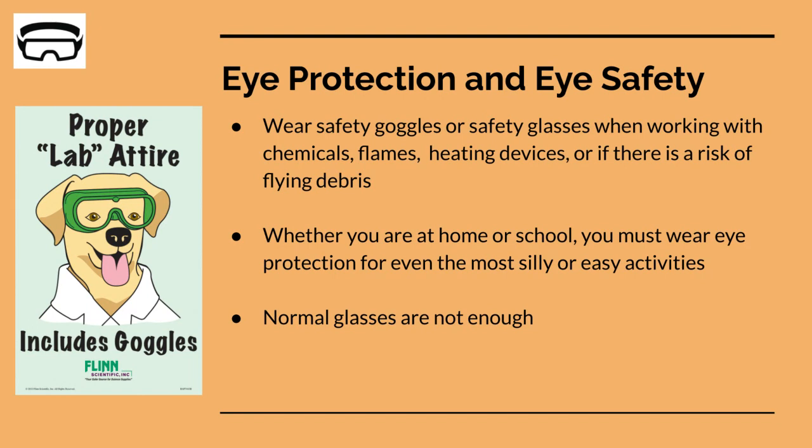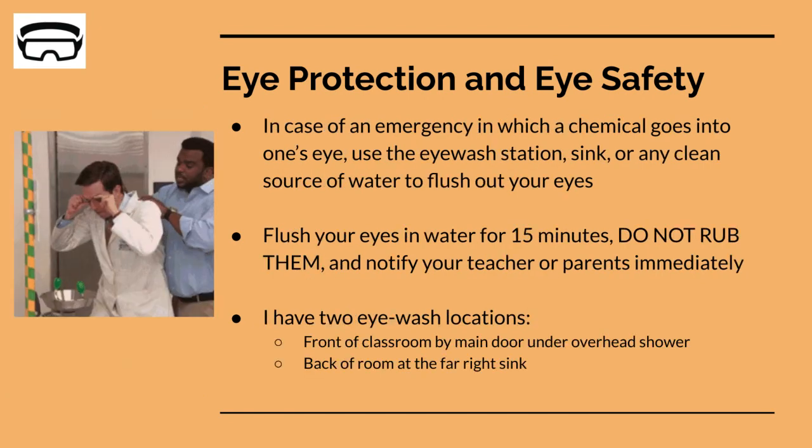And for those of you that wear glasses, normal glasses are not enough. If you're wearing glasses and you're able to touch the sides of your eyes just by putting your fingers on the sides of your eyes, that's not good enough. There are safety glasses that you either put over your normal glasses, or goggles where you can't touch the side of your eyes, because normal glasses allow debris and other chemicals to get behind your glasses and get into your eyes. You need something that completely covers and surrounds your eyes that glasses just can't do.